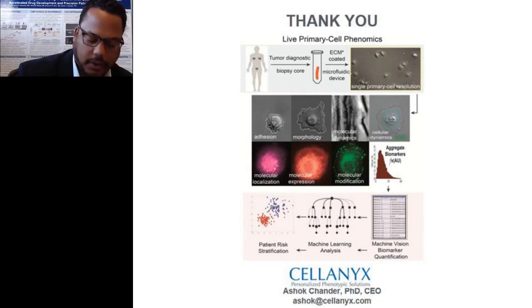And so the ability to leverage artificial intelligence, as it were, to then sequentially measure and analyze and compare thousands of biomarkers over thousands of cells, essentially 45 million measurements per sample, and then come up with a ranking of those biomarkers over the multiple levels of regulation again.